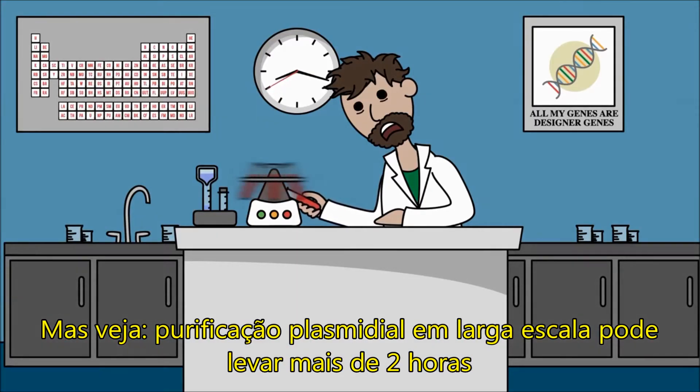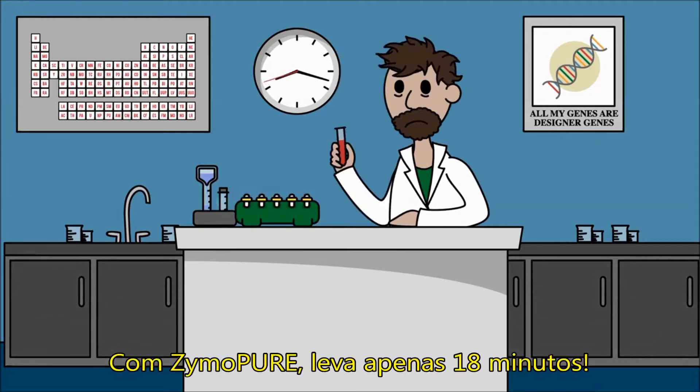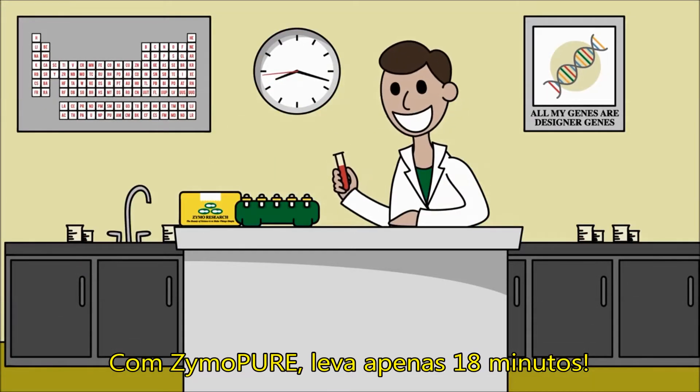Large-scale plasmid purification can take over two hours. With ZymoPURE, it takes 18 minutes.